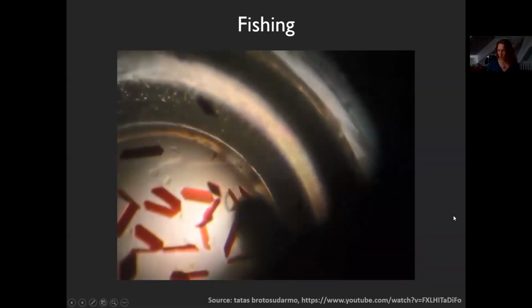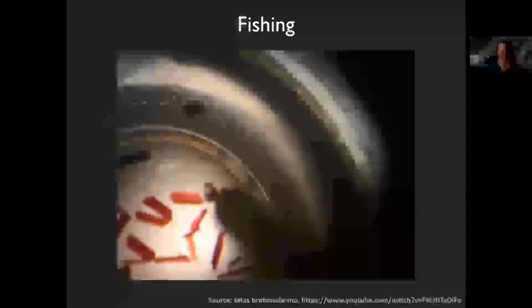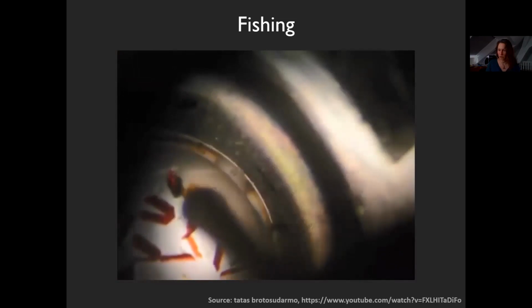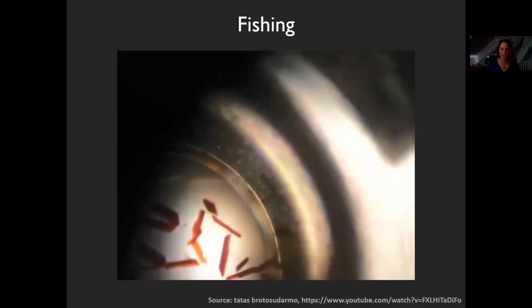There is the loop. It's a sitting drop plate. You can see the whole thing is very viscous. She tries, she doesn't catch it. And there we go, it's sticking. You can see it's sticking. She takes it out. She will now very quickly drop it into liquid nitrogen. It must have already been cryoprotected before she fished it. Or she has to take it out and put it in a cryoprotection.